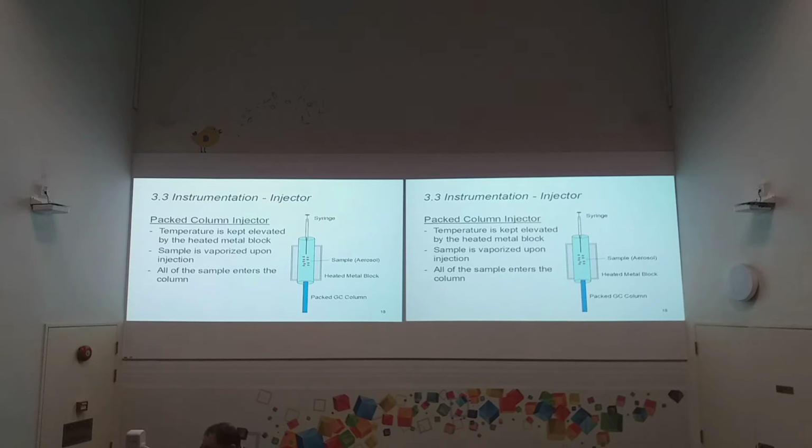But there's a reason behind this. Let's say the assumption is that we have no choice, because for the analysis I don't need 1 ml, I don't need half a ml. I only need 1% of 1 ml, 0.01 ml. How can you do it? It's very difficult, right? 0.01 ml is just a tiny bit of the sample solution.